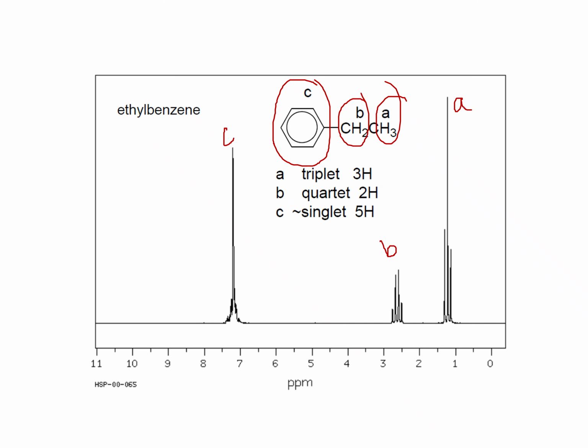So it's having very high height because of 3 hydrogen. Okay, and you can say B only has 2 hydrogen, so this is lower height. And you know here 5 hydrogen remaining, so it would be sharp because of 5 hydrogen. Okay, its height is increased. Then here would be one singlet, you can say one sharp peak here. Okay, this is called singlet. You can also see a lot of peaks here. This is absolutely true for the aromatic ring because we have some deshielded delocalized electron and proton, that is why it has some noise here. Okay, but the overall peak is singlet.